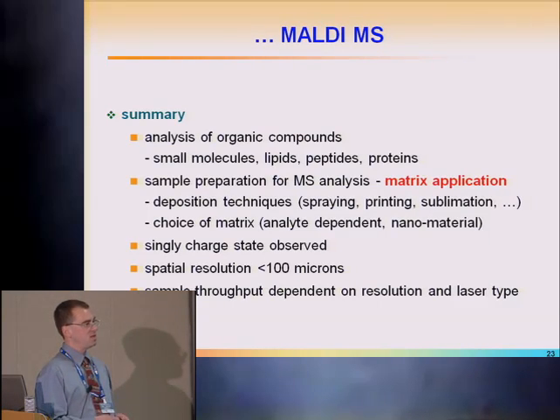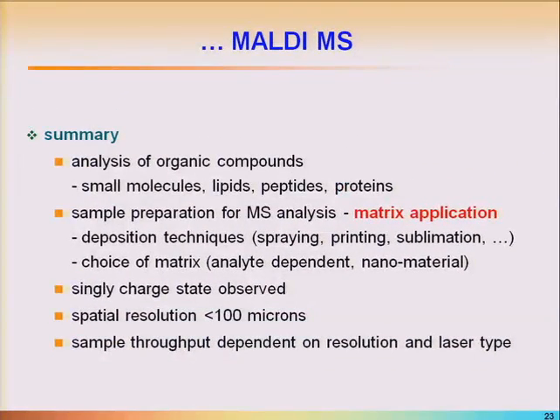There's a single charge state observed with MALDI-MS, and the spatial resolution is now less than 100 microns, and the sample throughput is clearly dependent on resolution and laser type. For these examples that I showed of these tissues, even the eye itself, one analysis is 8 hours. So if you get 2 analyses done in a night, that's a good data set.